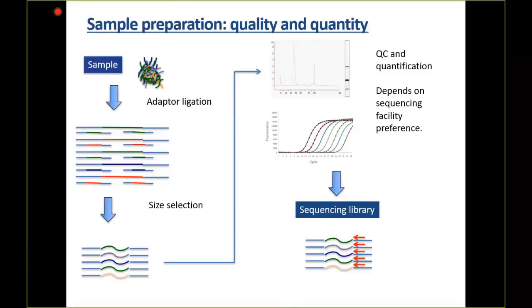So generally for library prep, you start off, you get your adapters. You're going to do a size selection, at least in a lot of cases. Size selection is, let's say that I take the genome and I initially fragment up the genome. So both with RNA and DNA, you'll frequently do fragments. Anybody know good fragmenting methods?